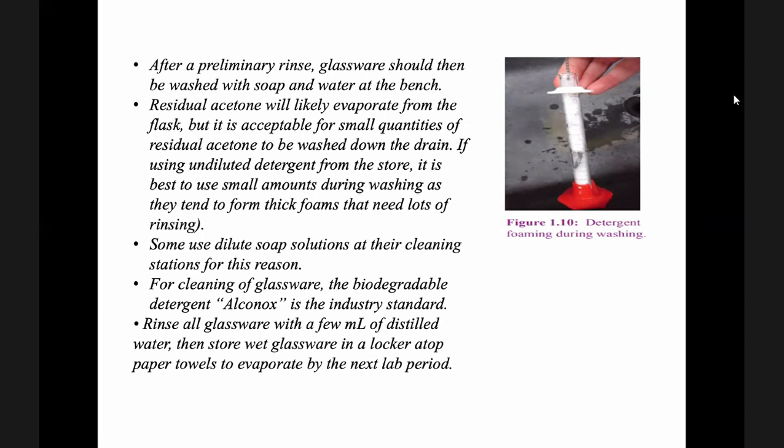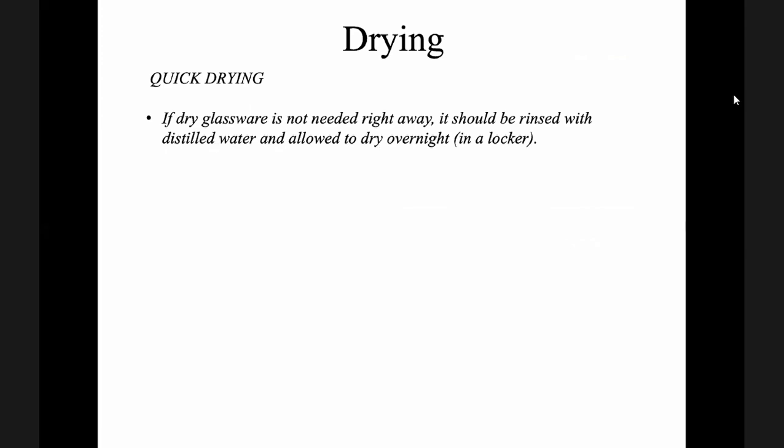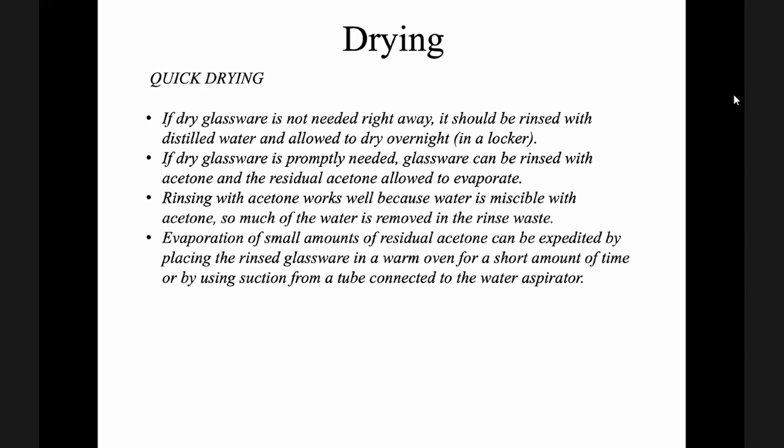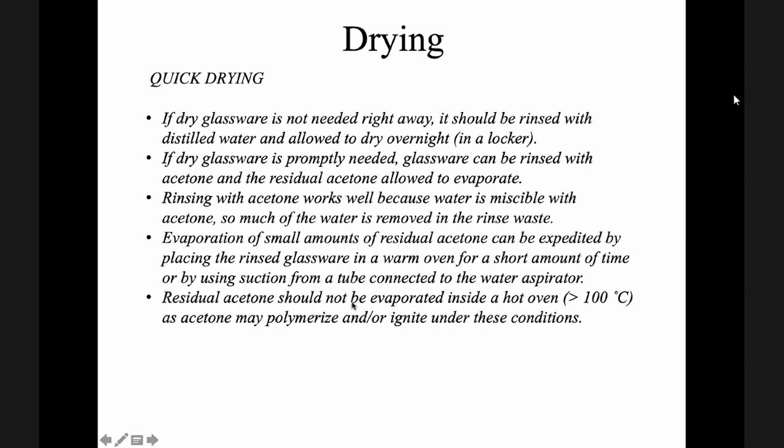So after that, now rinse our glasswares with a few ml of distilled water, then store wet glasswares in a locker atop paper towels to evaporate for the next use. Next, for quick drying, you can use an oven for a temperature less than 100 degrees Celsius. Pwede man siya for speedy drying kung gadali gid ka mo.